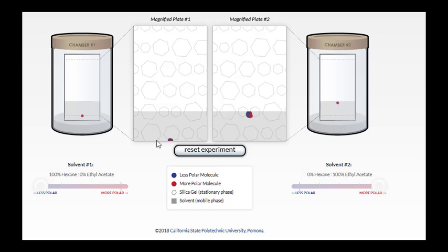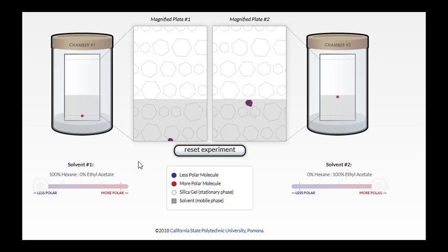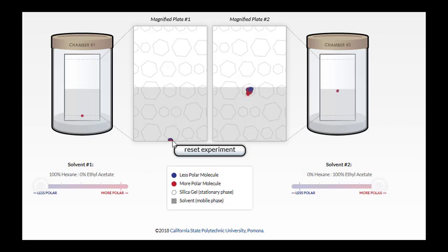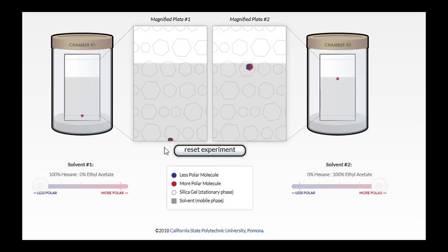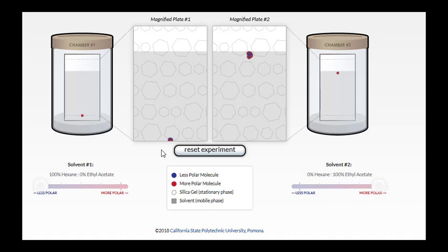When we use a totally nonpolar solvent, it is completely ineffective at moving our compounds at all. So they simply stay at the origin, and we would describe that result as having an RF of 0 when they travel not at all. So this wouldn't be a very good solvent to do a TLC analysis.